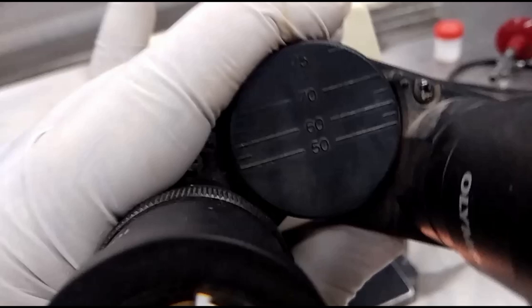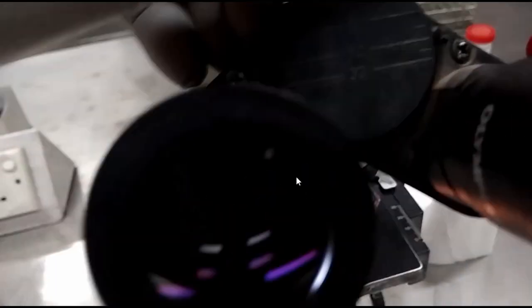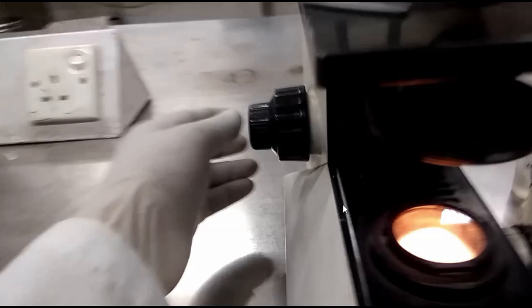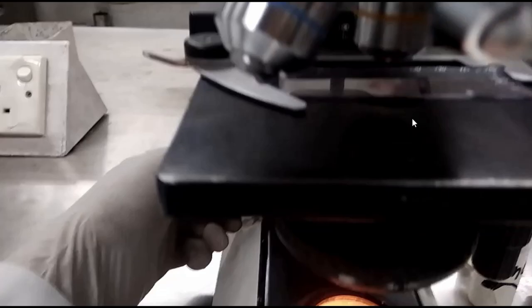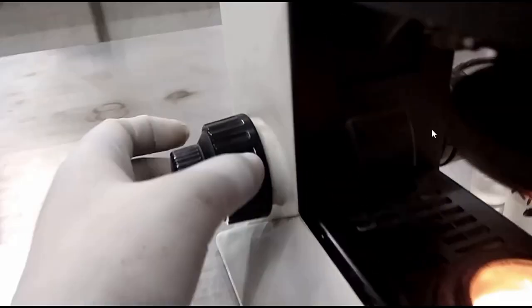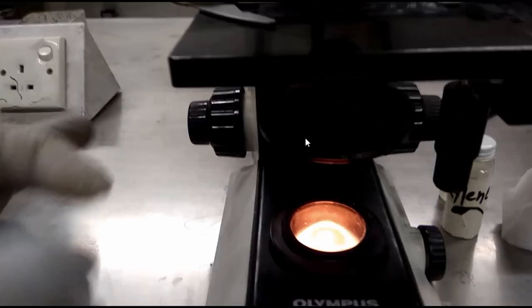Eyepiece. It may be of 5x, 10x or 15x, but here these are of 10x. We are going to observe a specimen. That is the sputum Gram stain slide. We are trying to observe it with this microscope.